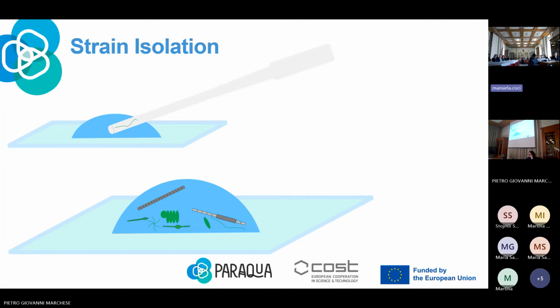It depends on you, and after several dozen such steps, we have a chance to keep this specimen in the subsequent drops of the medium. And if there are no other microorganisms around, we could start the cultivation of our target isolate.